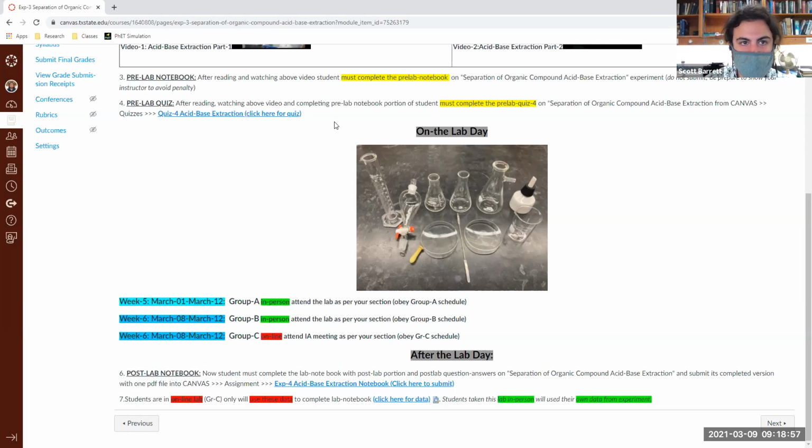So on the lab day, these will be the utensils, the apparatus, that we'd use. I will look inside the lab manual as we read through it to see if there are any particular machines. So you have your graduated cylinder, you have your different size Erlenmeyers, you have your vacuum filtration flask, you have your beaker, and make sure to list out the sizes of these, because there are even graduated cylinders that are 500 milliliter or liter.